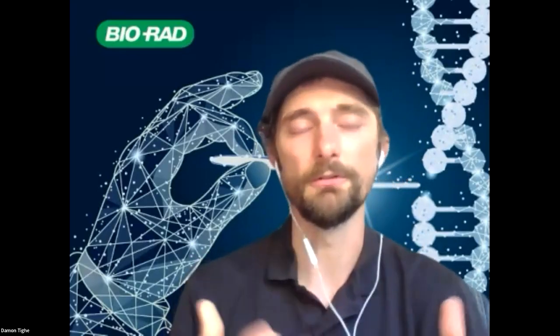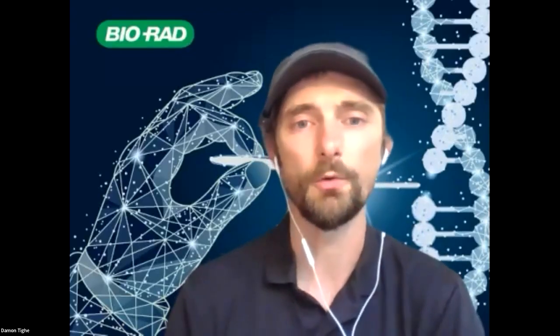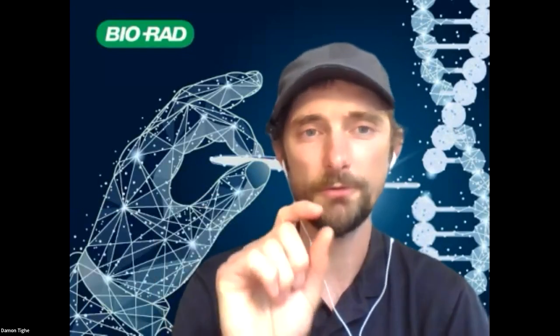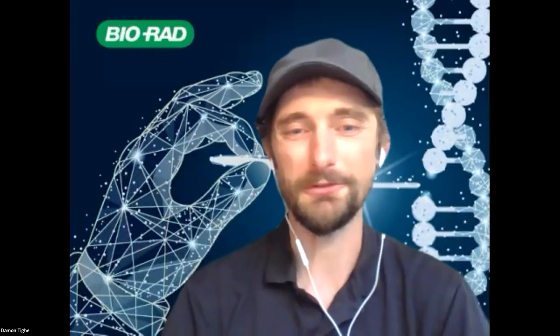Is there anything that you have to worry about, Damon, with the PBS or anything being cold? Not really. The only thing I'd worry about with cold is any sort of condensation that might take place in the cuvette. But with any sort of protein lab, I would say you always want to let things get to room temperature before you start to work with them. The only thing here that you might take straight from the fridge and use right away is the standards, but that's going to be 20 microliters going into a full mil. The temperature on that is just going to fade into the background, so you don't even have to worry about that.